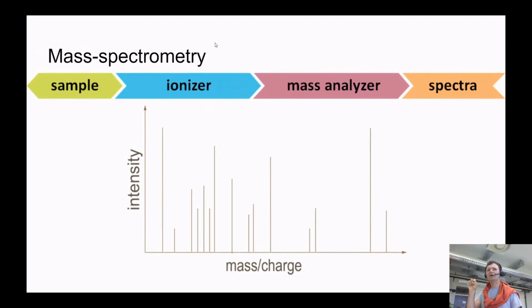This instrument was just a laser which was beaming to this piece of paper, and ionizing molecules inside. All these ionized molecules flying in the instrument, and this instrument is building such spectra, intensity, mass to charge. And what's the purpose of this instrument? This instrument will find out some intensity in, let's say, mass to charge 150. I say just out of my mind, 150, and let's say it's trinitrotoluene, a very dangerous explosive. As a result, if this instrument will see some intensity in this mass to charge range, then that means there's some danger going on.